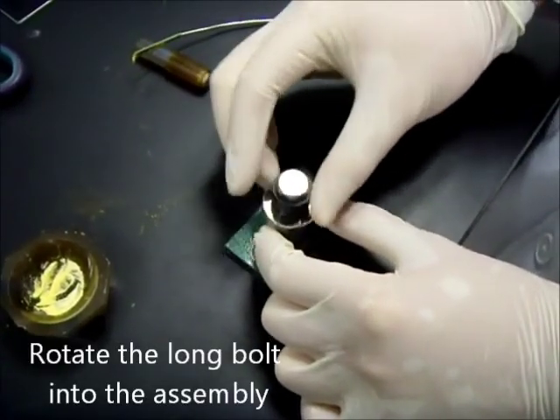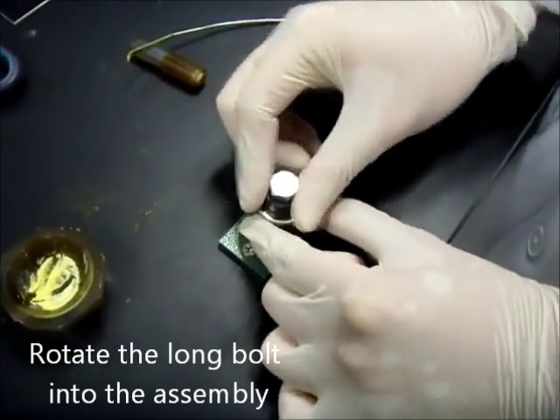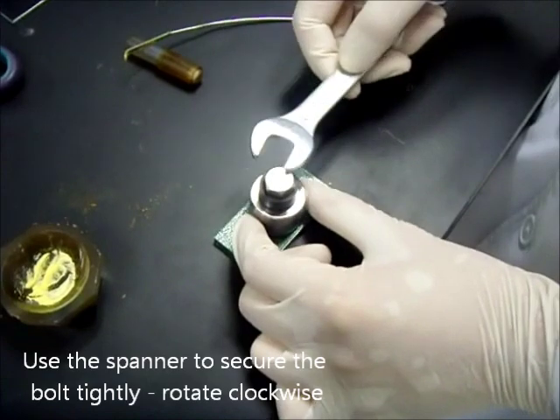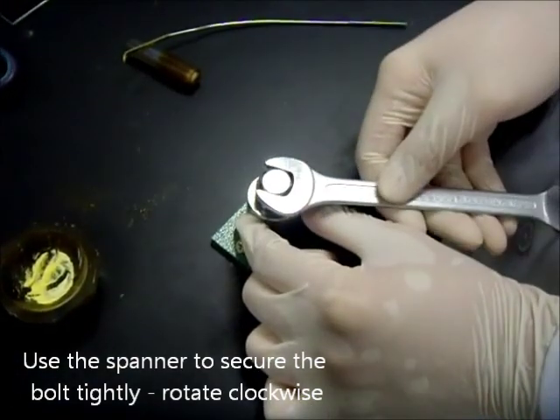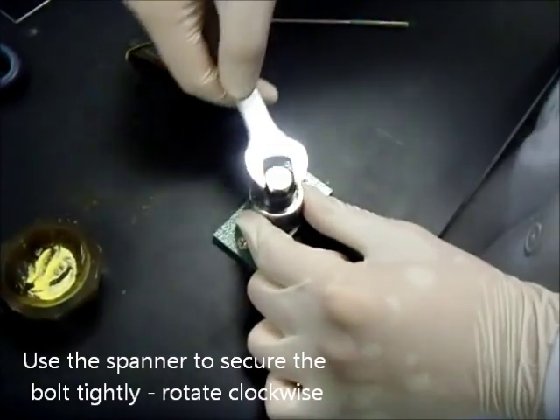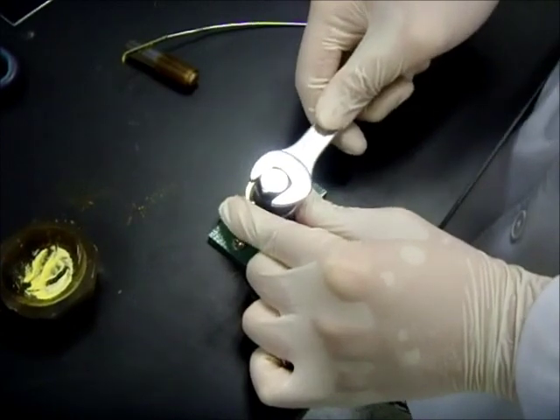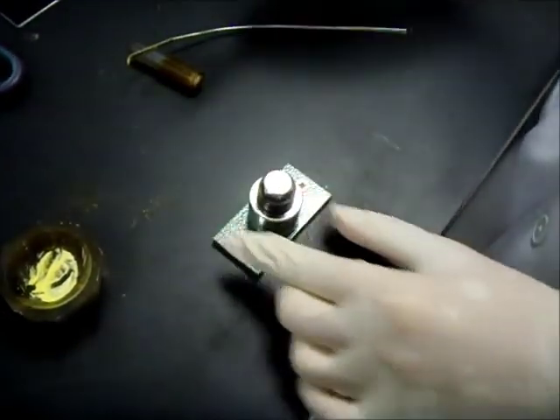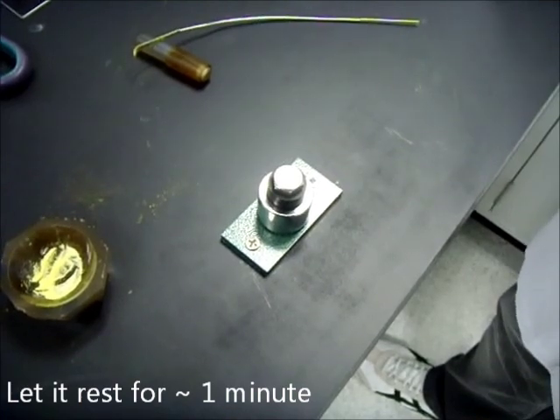Now rotate the long bolt all the way into the assembly. Use the spanner to secure it tightly by rotating it clockwise, and let it rest there for about a minute.